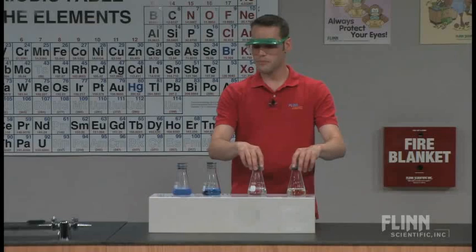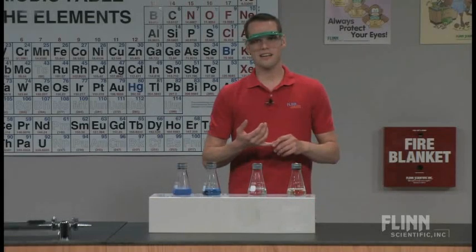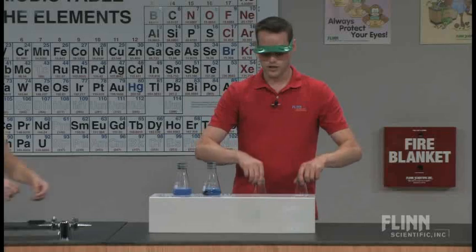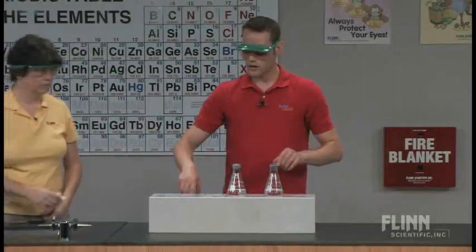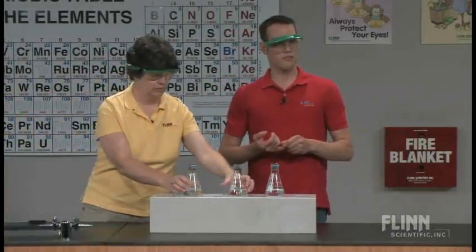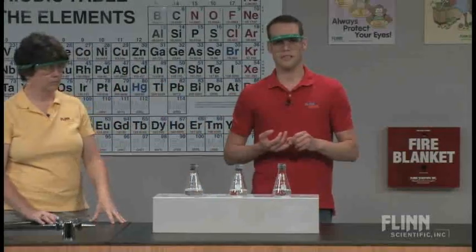Now, this one's temperature. We can do the same thing with concentration of reagents. I mentioned that inside of these we have dextrose, we have potassium hydroxide, and the methylene blue is what you're seeing change color. That's changing color as part of this reaction. So we have different concentrations here. In one of these, I have the same mixture solution that I've always had. In one of them, I've added 3 extra pellets of potassium hydroxide. And in one of them, I added 6 extra pellets of potassium hydroxide.